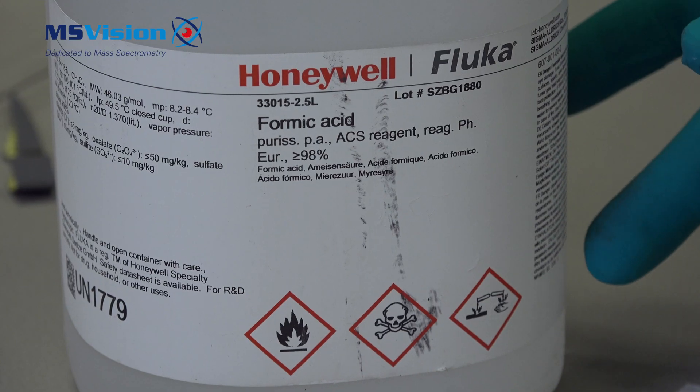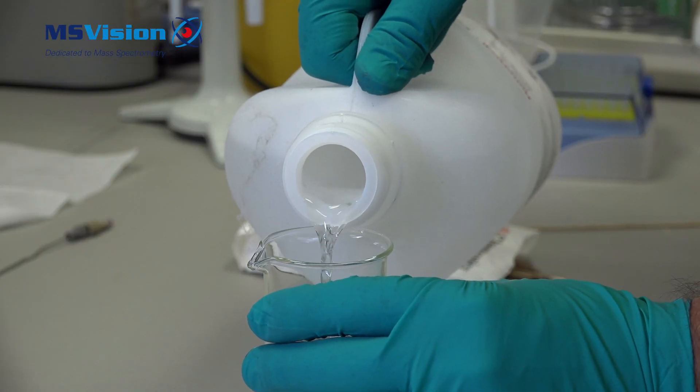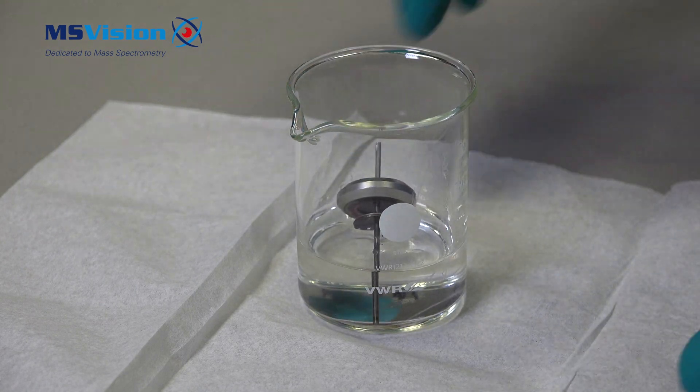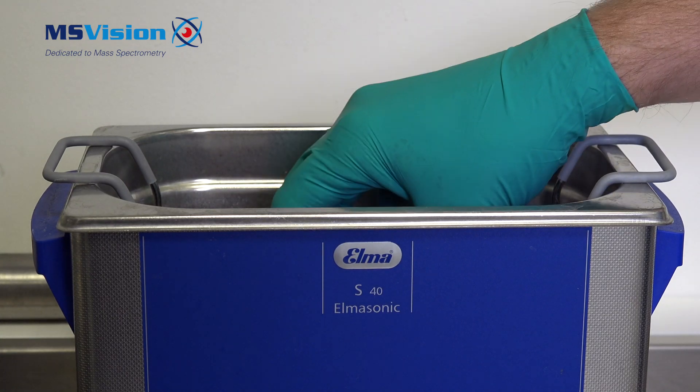Then carefully, partially fill a glass beaker with formic acid, placing the filament inside. Add water to the beaker and sonicate for 10 minutes.